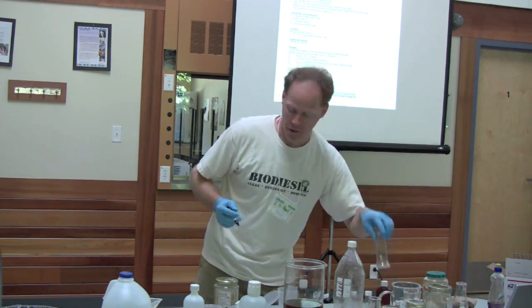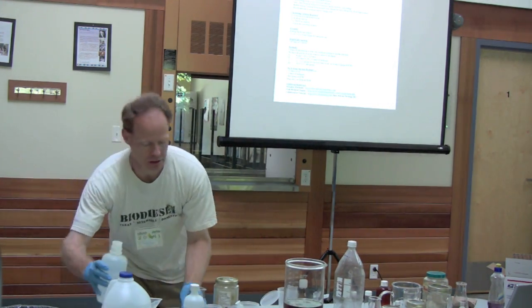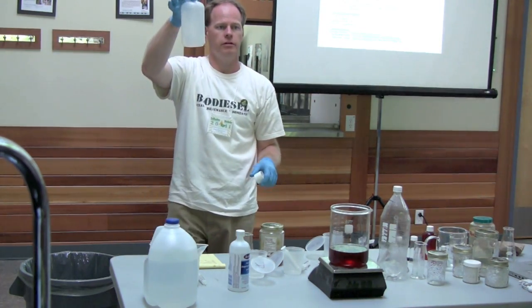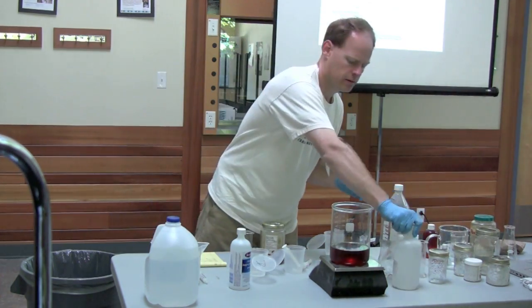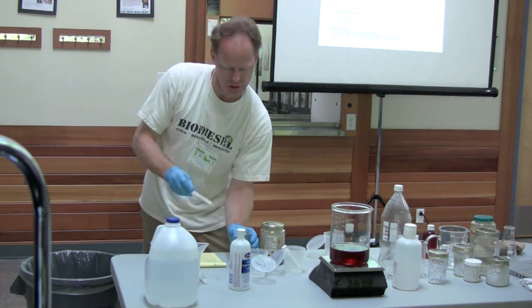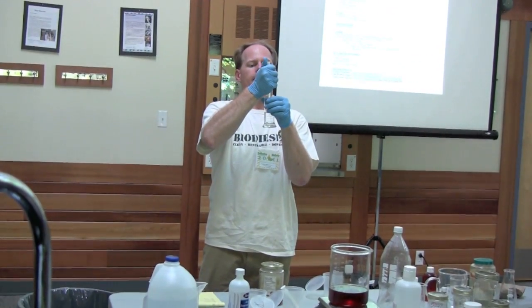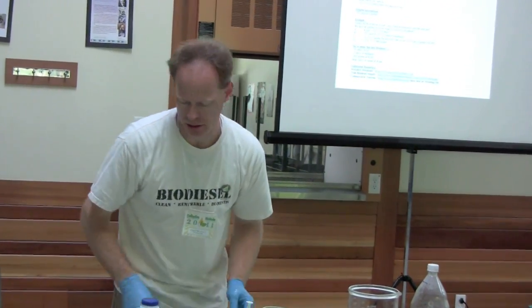And I'm going to use some of this for my titration solution. Pour a little titration solution in here. I'm not going to be using much of this, but this is the most important one not to draw from, because you don't want to screw this up. There. And this is for our oil. This titration solution. I like to pull my syringe up to about 10 to start. This is 10 milliliters. Again, I use that air bubble on top. Okay, just leave that in there.